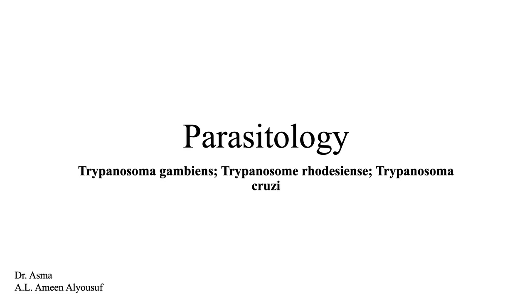So lab number 5 is going to include the topic about the trypanosoma. I'm going to explain the trypanosoma in general. I have specified some trypanosoma types like gambiense, rhodesiense, and then cruzi. But they have similar characteristics, similar features and shapes, so you cannot actually diagnose or differentiate one from the others. But how can we do that? We'll explain that later.